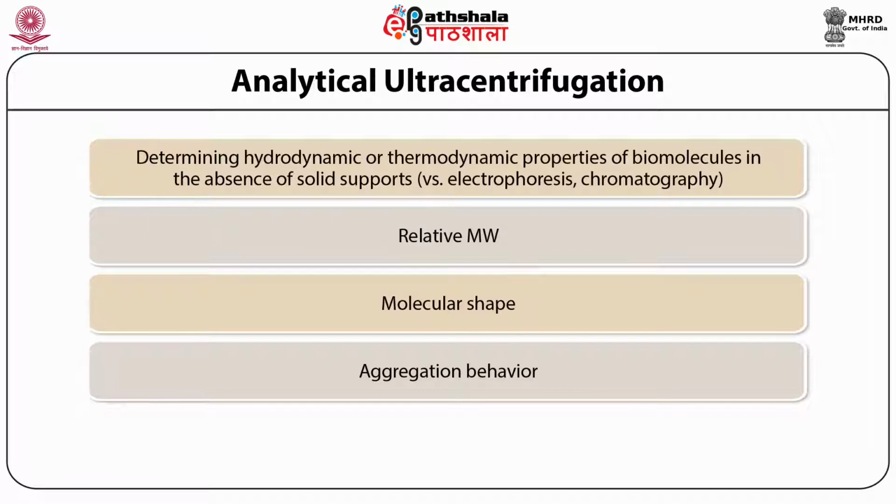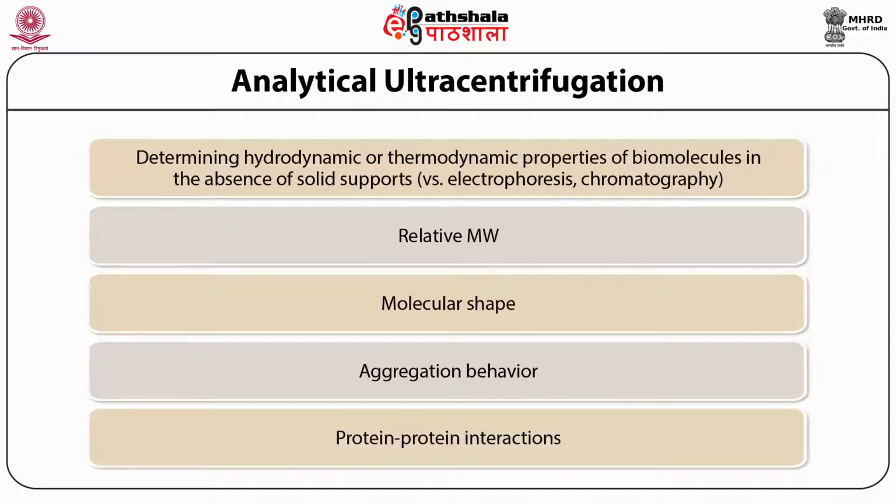It is also used for protein-protein interaction measurement, that is, how many proteins interact with how many proteins, like the stoichiometry of the protein as well as the binding affinity of the protein with ligand or protein-protein interaction. So these are the major applications of the analytical ultracentrifugation techniques.